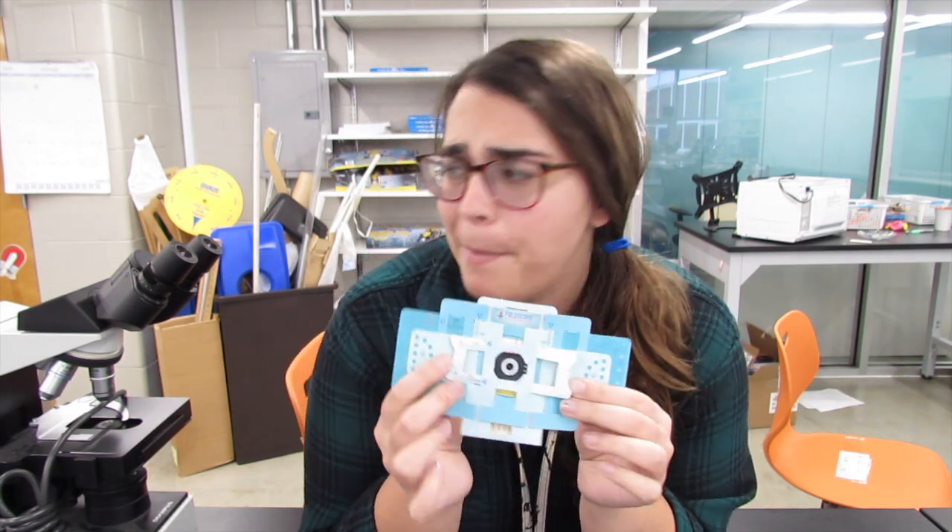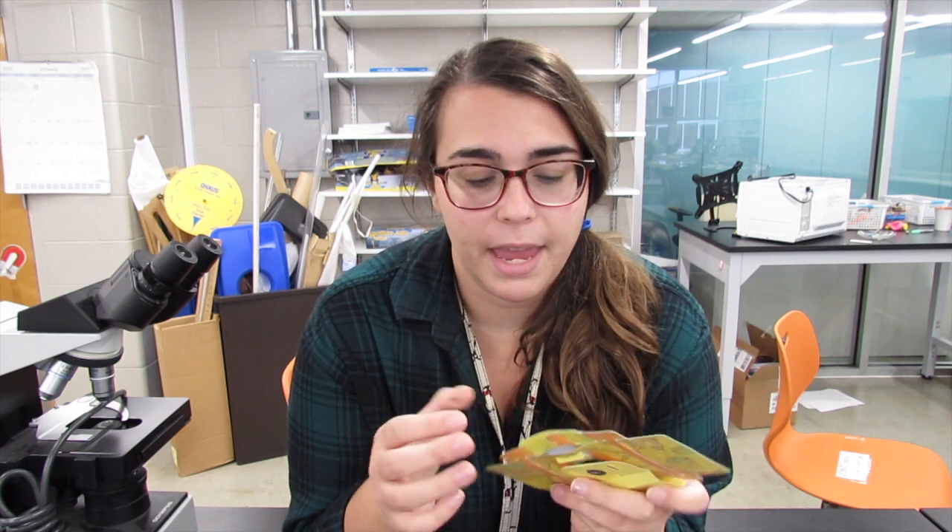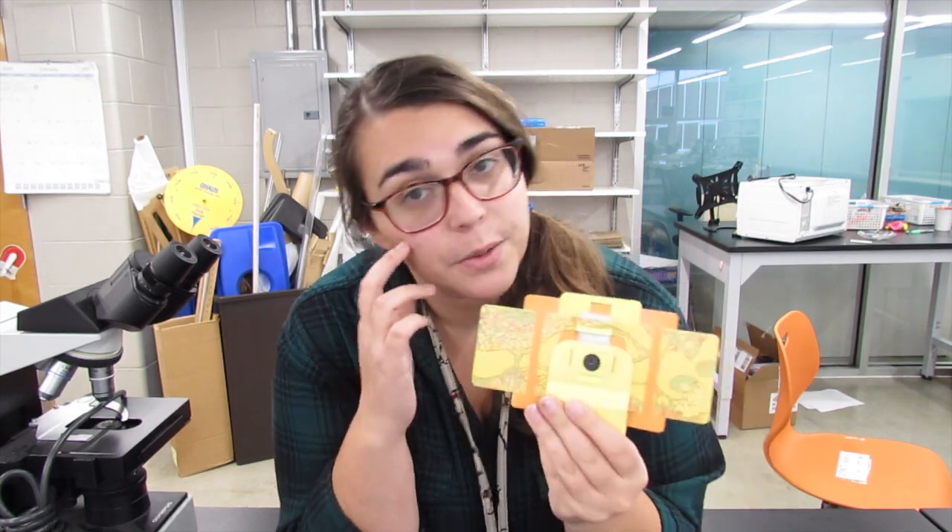Foldscopes were specifically designed by a company that wanted to make microscopy more accessible to everyone, especially to kids in schools that don't have as many resources as our school. The Foldscope company has come up with a cheap alternative that magnifies almost as well as a traditional microscope. The Foldscope only costs a few dollars to make, and it's pretty easy to use. This one I bought unassembled, and I actually cut it out and put it together myself.